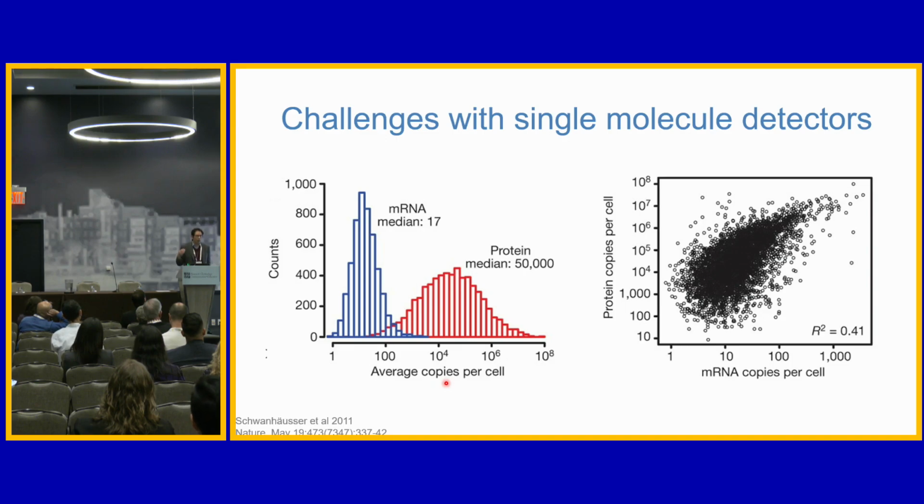Now, in proteomics, we have a very well storied history of vetting specific detections for confidence. How good do we believe this specific protein detection, not just how good do we believe the confidence in the quantitation? In the RNA world, typically they just measure the confidence of the quantitation, not even caring about the quality of the detection itself.